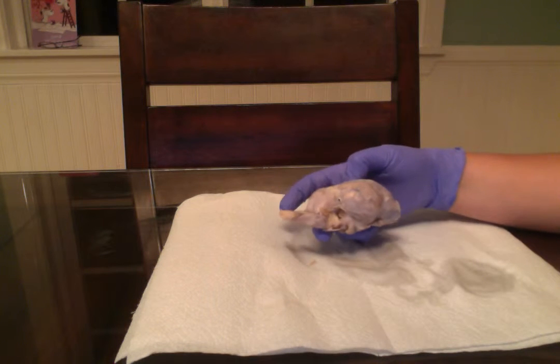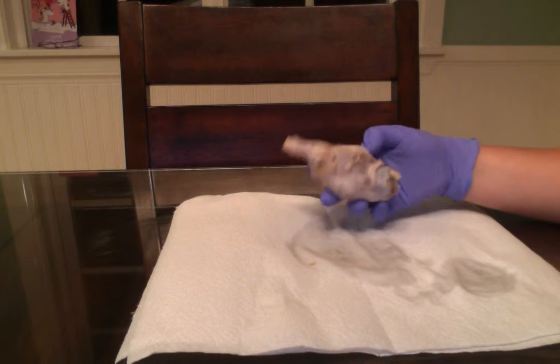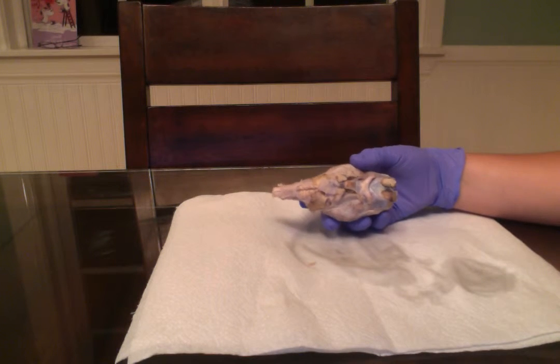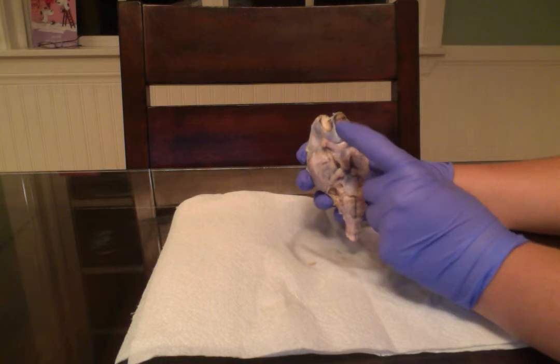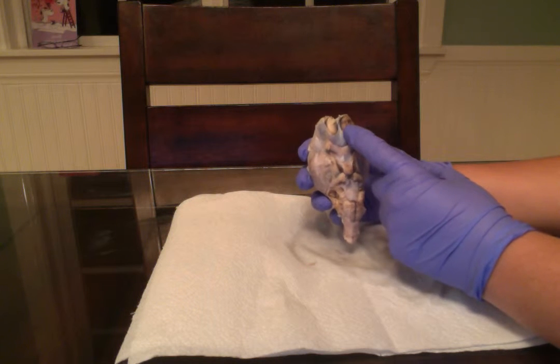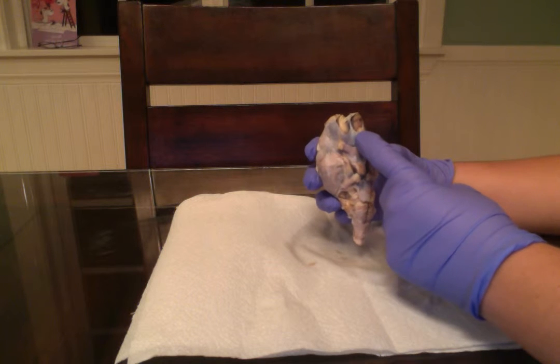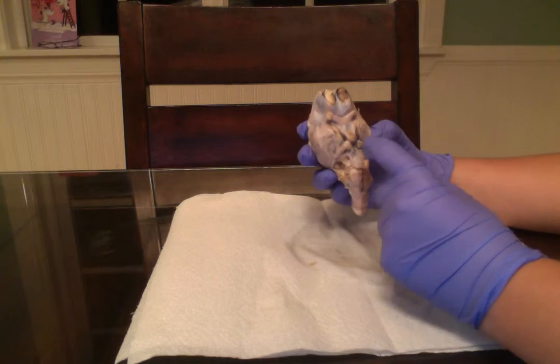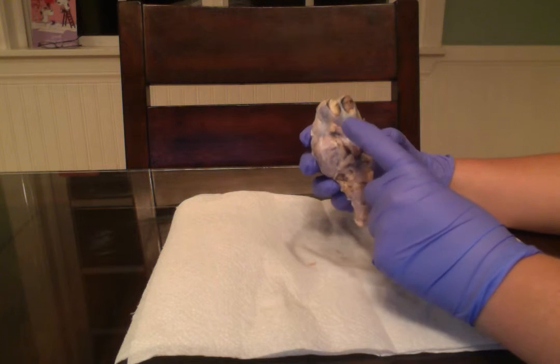We are now going to look at the ventral side of the sheep's brain. So that would be this underneath area. And if we look at it this way is a better way. So we have the olfactory bulb. We have the olfactory tract. We have the optic nerve and the optic chiasma.